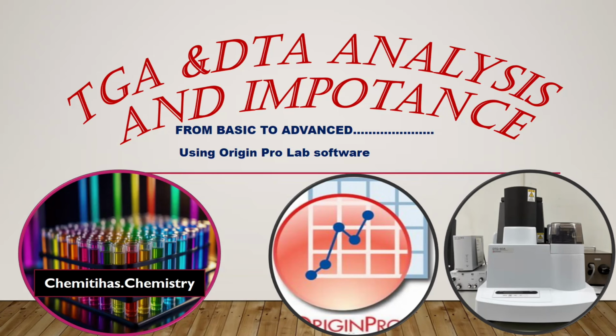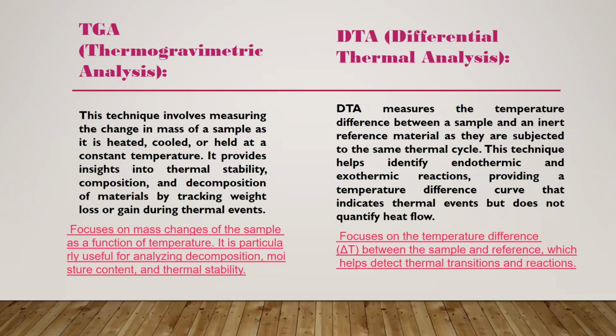So I'm going to start this. Mostly we are analyzing the material's thermal behavior using these two powerful techniques called thermogravimetric analysis and differential thermal analysis, which actually help us to understand the material's behavior towards heat. TGA tracks the changes in mass, while DTA detects the thermal events like melting or decomposition. Together they give us a complete picture of the material's thermal stability and phase transition.